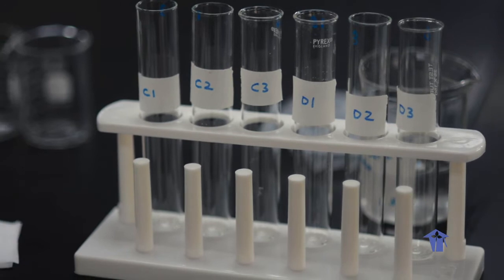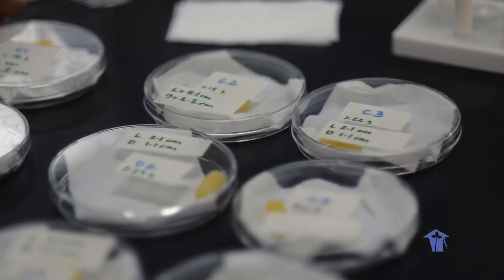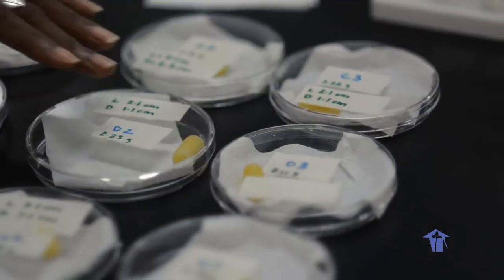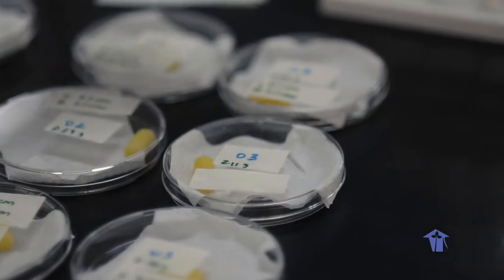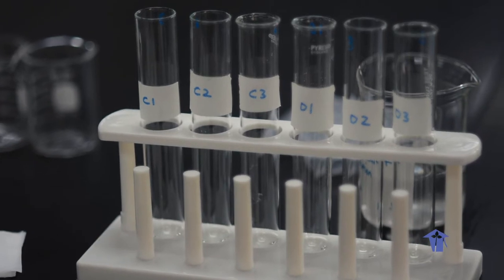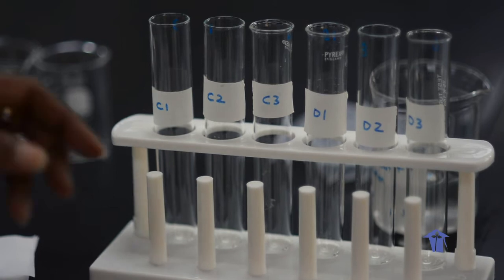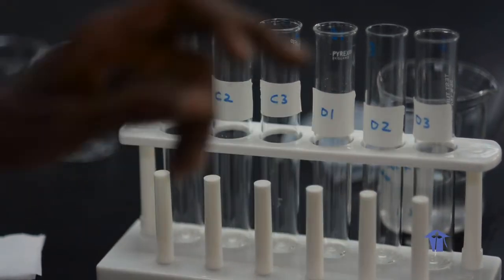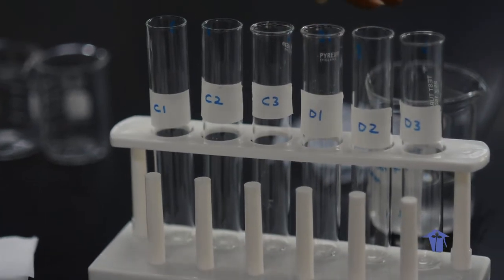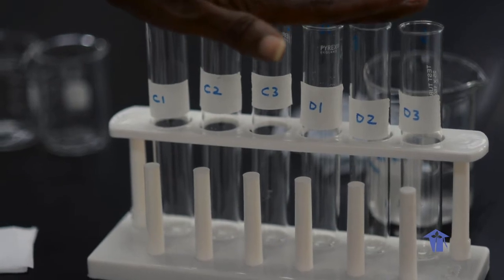The next set, we are using a dilute solution of salt, and we are going to place our potatoes. Again, we have them all laid out here in the petri dishes. We are placing them into the same volume of solution. So again, we are using 10 mils of solution that we are going to pour into each of these boiling tubes that are labeled D1, D2, and D3. So these would be the setup for the dilute salt solution.